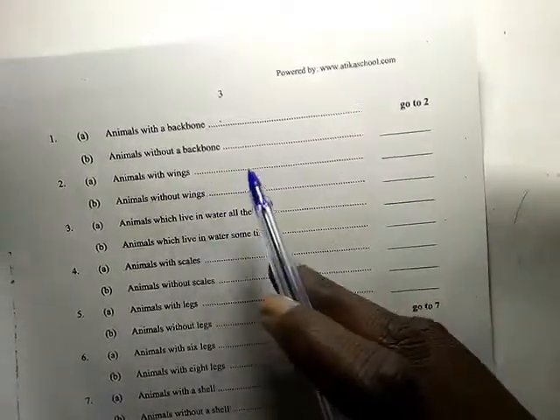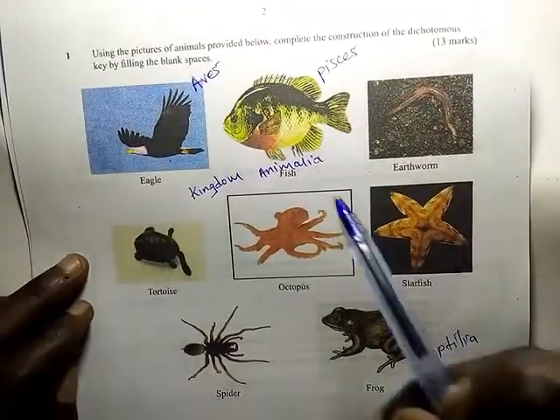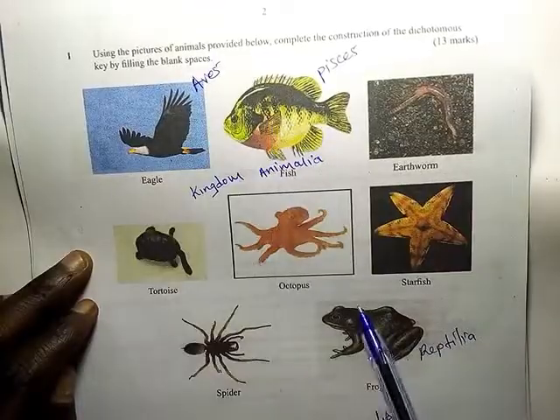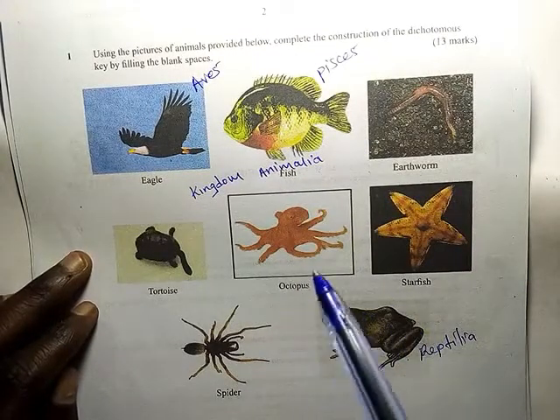Now we are told to go to two. Those without backbone, you leave that like that. And then we have identified the three. Now you look at the distinguishing characteristics of the three.